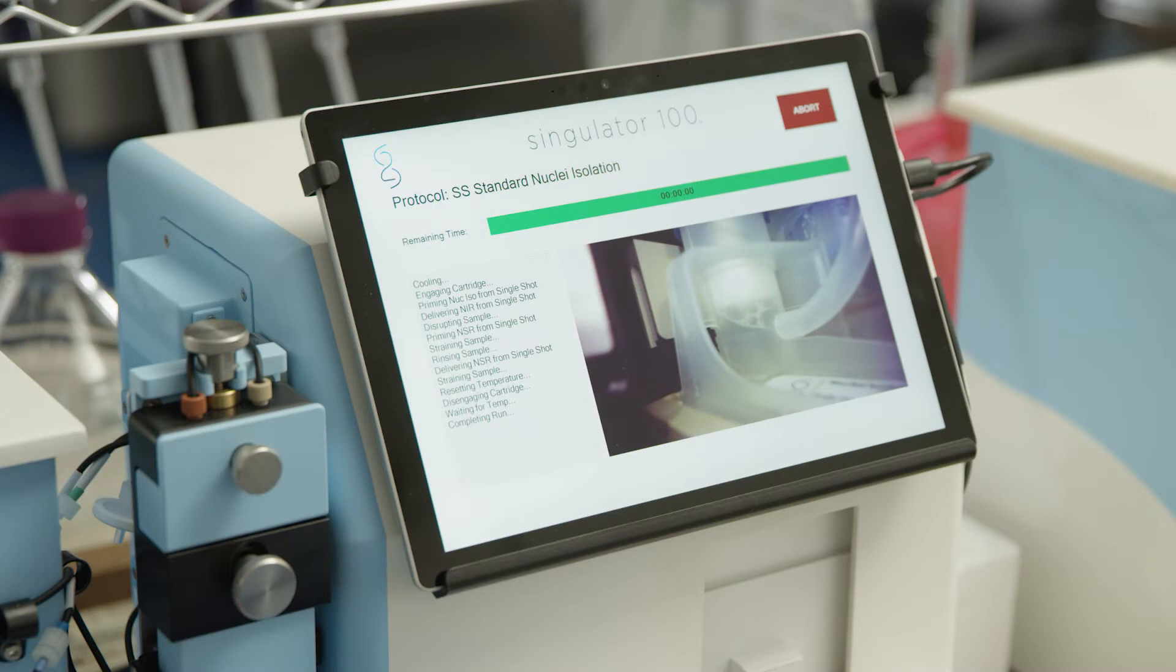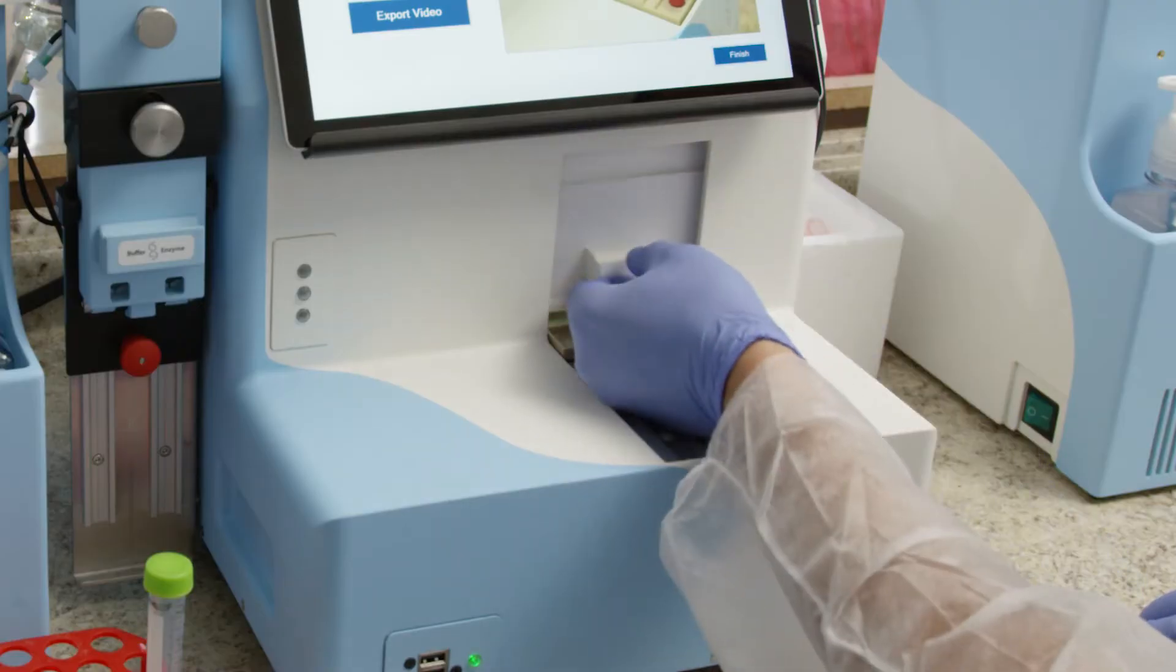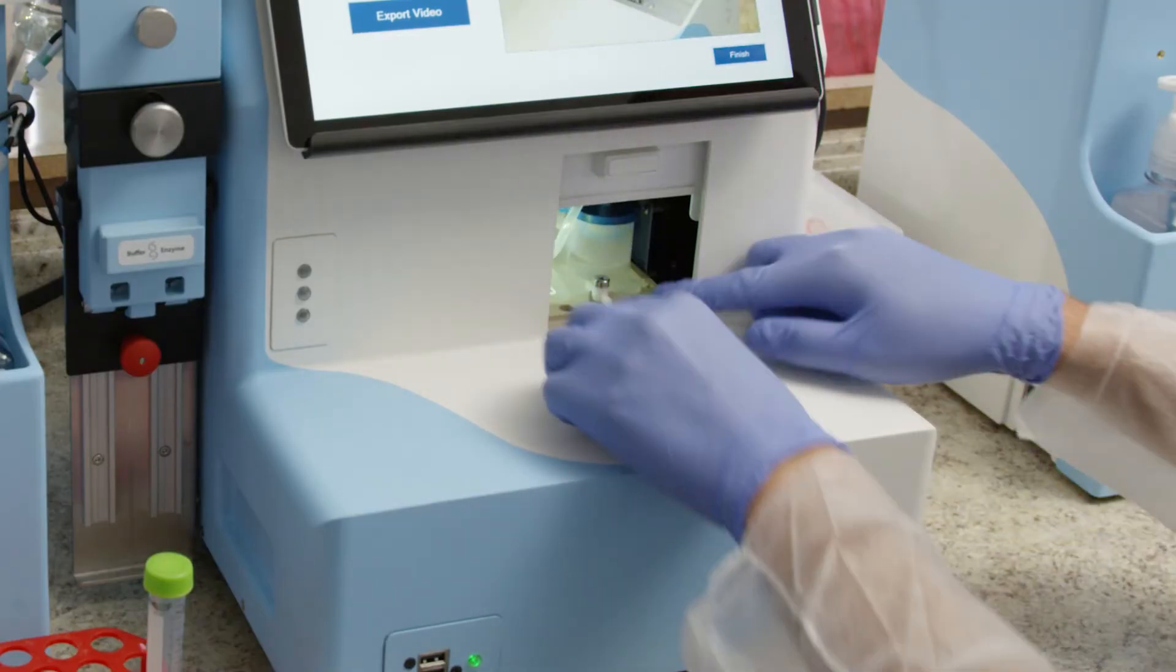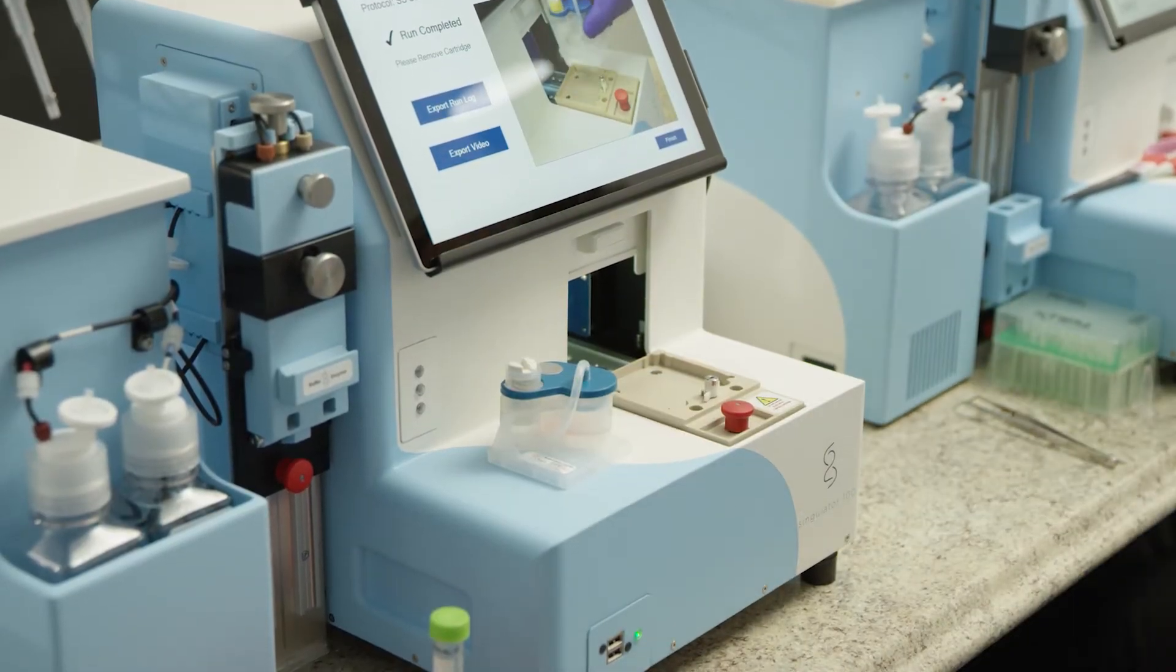The Singulator software will provide a notification when a run is complete. Open the door, lift the red knob to release the stage and slide the stage out of the instrument. Turn the rear cartridge lock to release the cartridge and lift the cartridge off the stage.